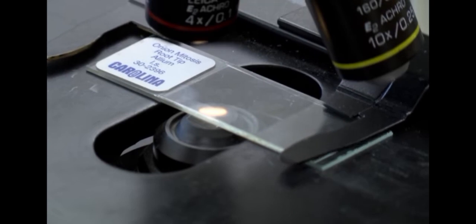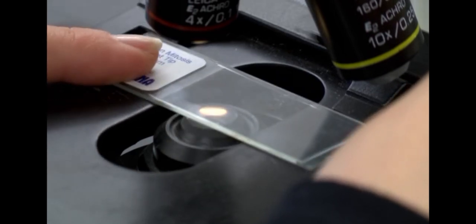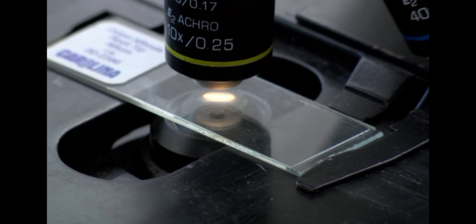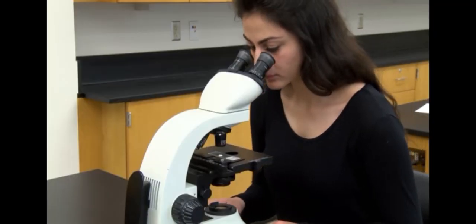Eight. View through the eyepieces and, without disturbing the coarse adjustment settings, slowly rotate the fine adjustment knob in the appropriate directions until the specimen detail is as sharp as possible. Focus. Nine. Adjust the interpupillary distance between the two eyepieces by sliding the eyepiece plates in or out.